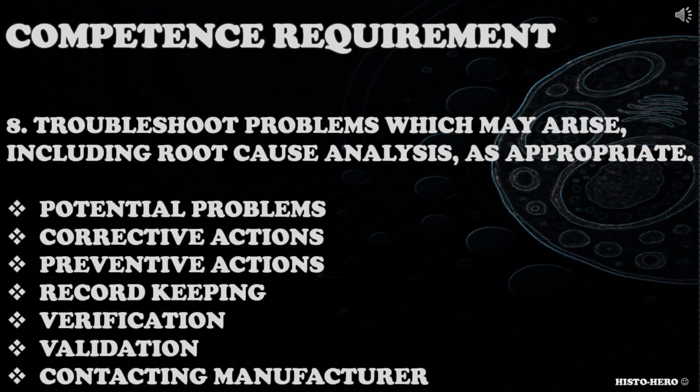When addressing this competence requirement, candidate could consider potential problems like chatter, scores, creases, tissue lifting, thin cutting, not full face, folds, squames, carryover, corrective actions taken, preventive actions, record keeping, verification and validation, ways of contacting manufacturers and so on.